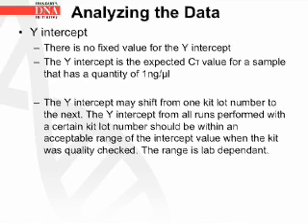For the y-intercept, there is no fixed value. The y-intercept is the expected CT value for a sample that has a quantity of 1 nanogram per microliter. The y-intercept may shift from one kit lot number to the next. The y-intercept from all runs performed with a certain kit lot number should be within an acceptable range of the intercept value when the kit was quality checked. This range is lab dependent.